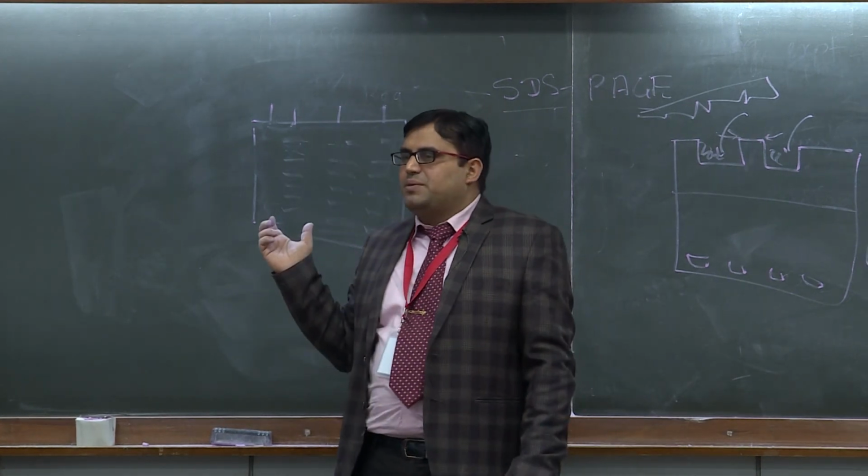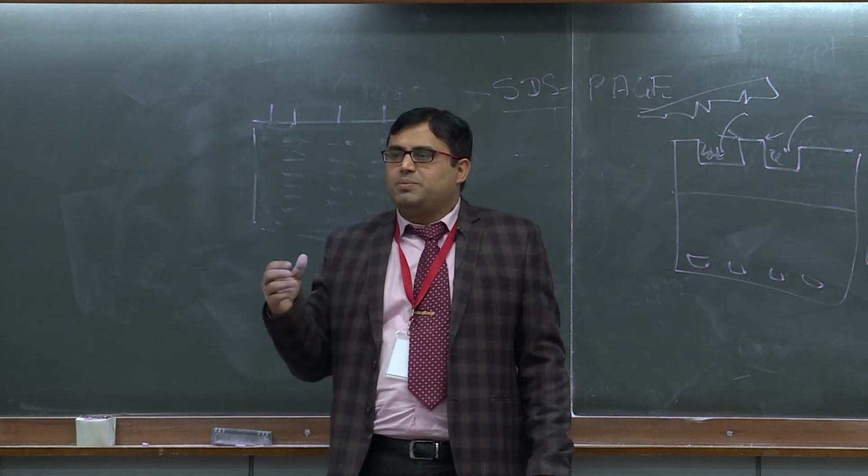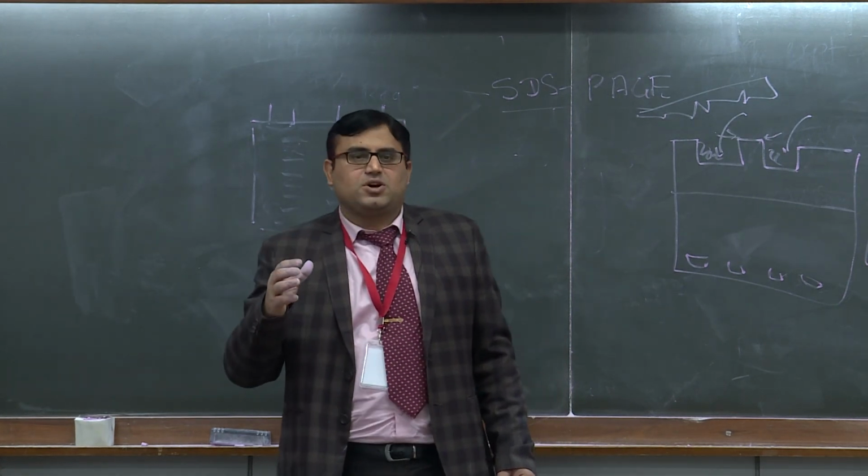So this is in brief about the SDS Page, and maybe during the experiment I'll brief you about 2D Page, right? So I'll stop here. Thank you.